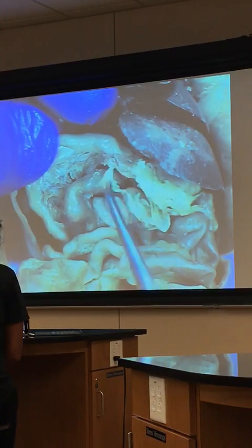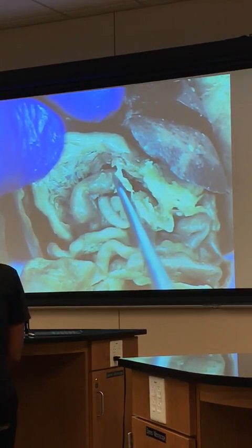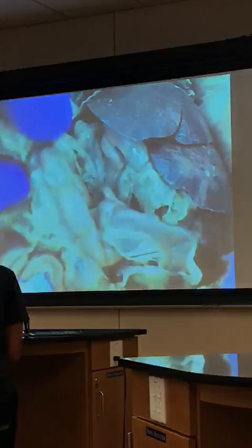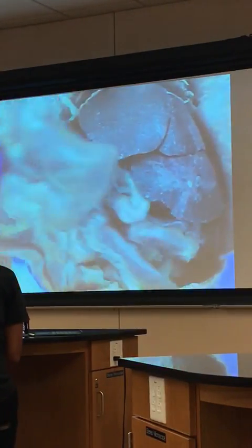Actually, we'll travel back over here. And so it's very diffuse looking on there. Right? But all this stuff right through here is the small intestines. So here's all the small intestines. And the large intestine is usually a lot easier to find.